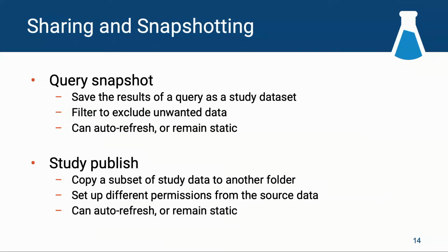All right, kind of the last stage in the workflow is sharing your awesome results with the world. There are a number of different ways you might be thinking about the appropriate ways to do that, and also retain the data in the state where it was ultimately approved and signed off on. Query snapshots are a way to take the current state of the data and snapshot it into a new table where it lives.